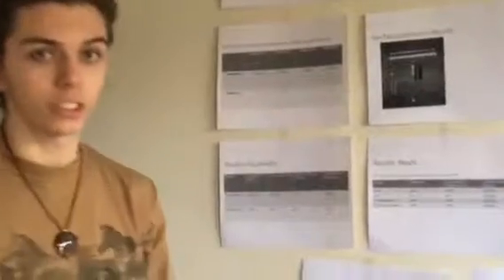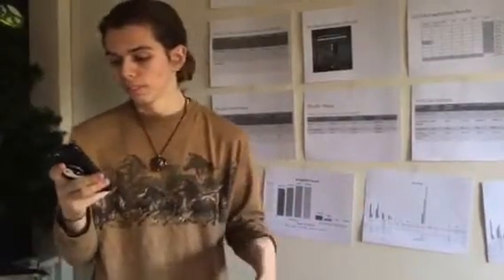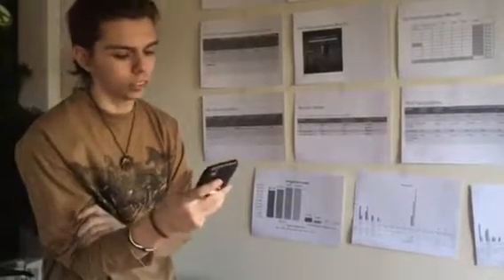Then we took the 260/280 ratios. The absorbance was set at 260 nanometers because DNA absorbs at 260 nanometers, and proteins, on the other hand, absorb at 280 nanometers. A 260/280 ratio is usually between 1.5 and 2.2, which indicates pure DNA. A ratio below 1.5 indicates protein contamination, and above 2.2 indicates contamination that is going to affect the rest of the results.